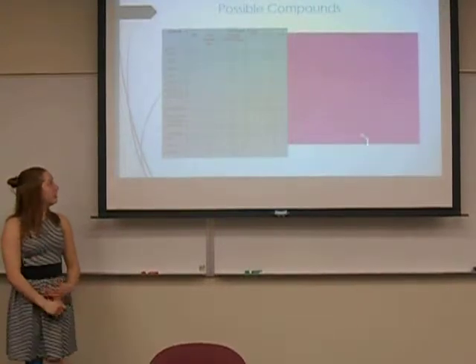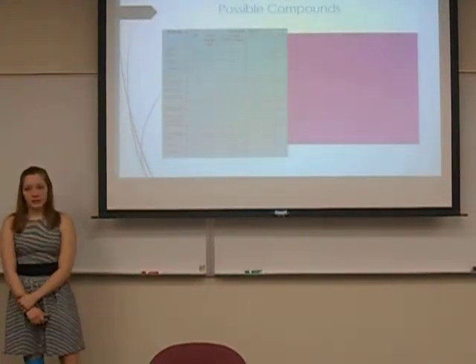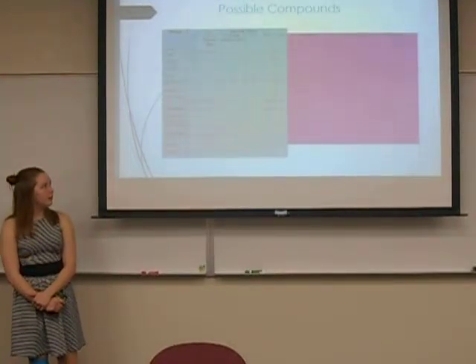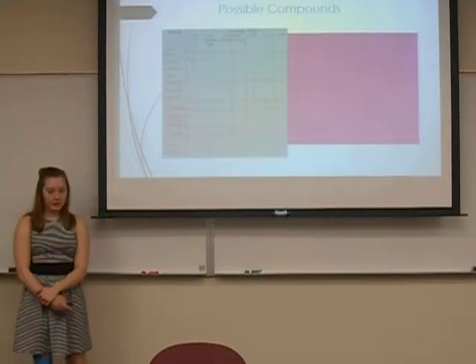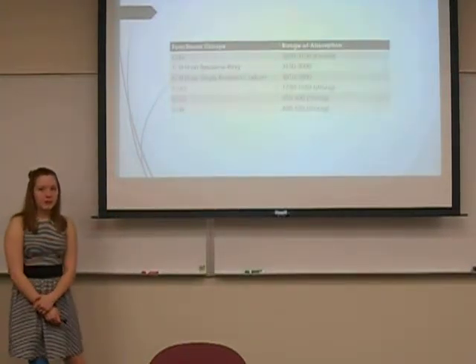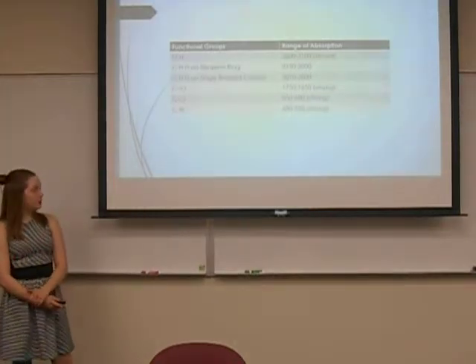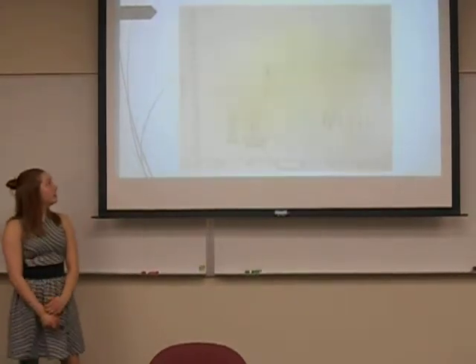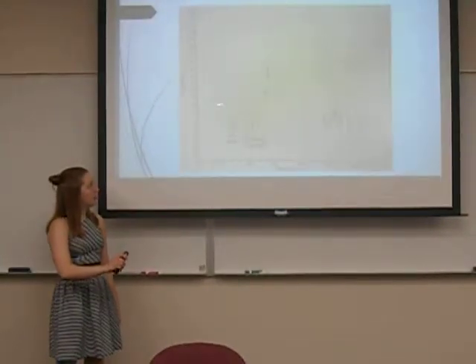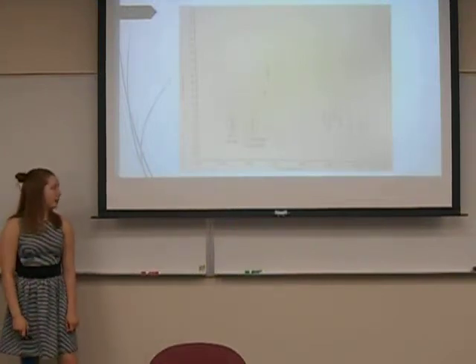So as you can see here, we have our 16 unknown compounds that were given to us in our laboratory manuals, and each of these have their functional groups for IR here, their peaks and ratios labeled over here. We will then use these to help determine our compounds. First, we started with IR spectroscopy. Looking here, we use this absorption graph again. On sample 59, you can see that right here, we had an OH group with a very broad band. These must have broad bands or they are not counted as a hydroxyl group.